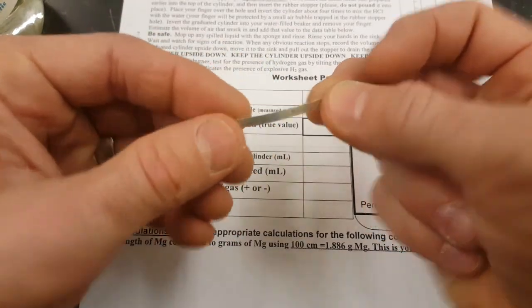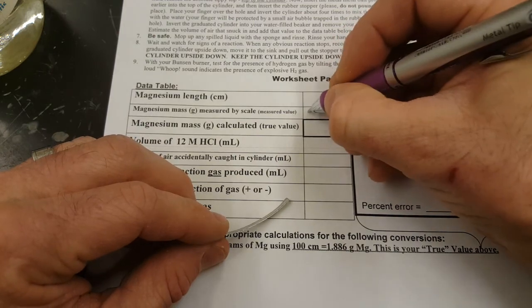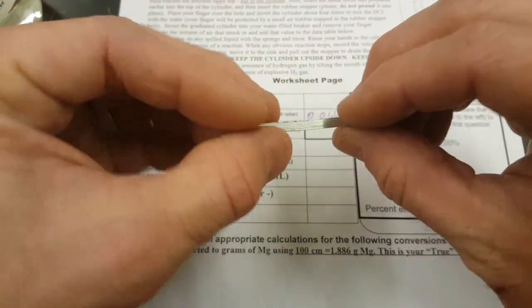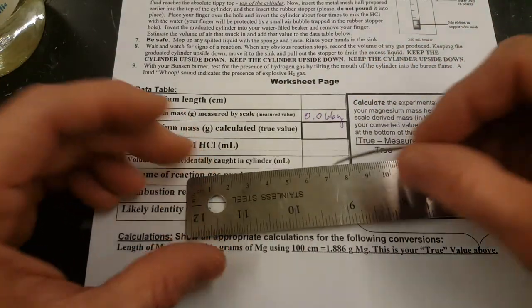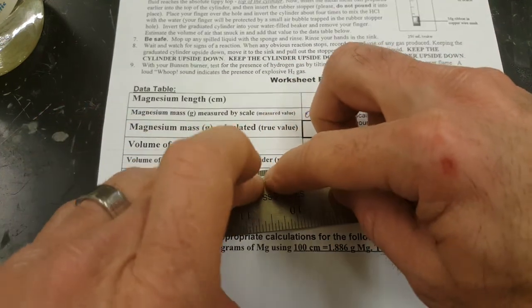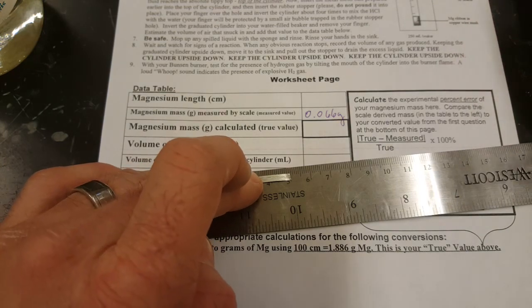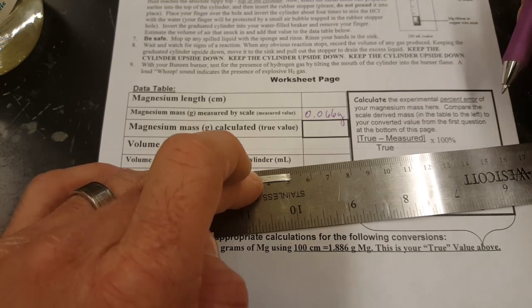I took my magnesium and I put it on a scale, and I found that its mass was 0.066 grams. Of course, find the mass of your own magnesium. These were all cut by lab assistants last week, and so they all should be within 4 to 5 centimeters. The reason that's important is because later on we're going to calculate a percent error here in this box. And so we'll need a true value and a measured value.